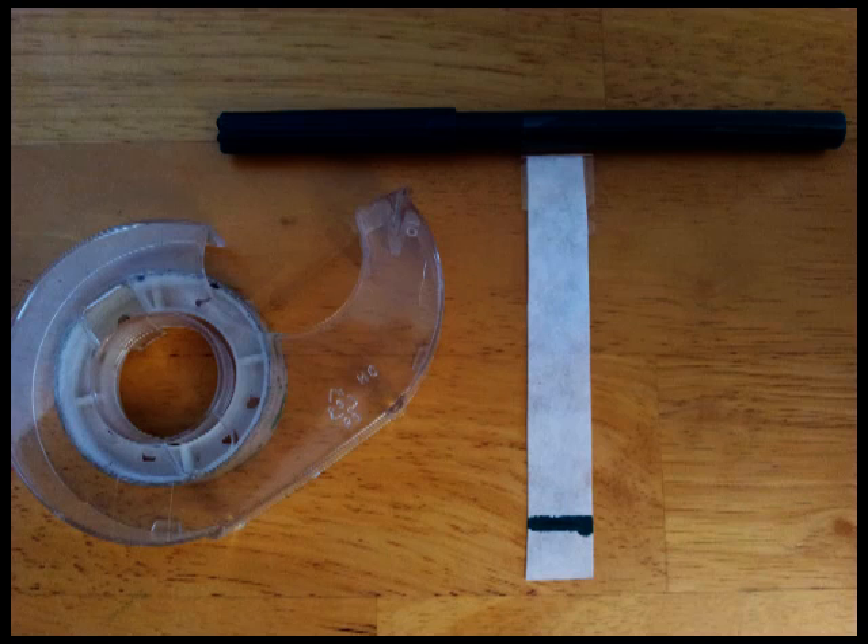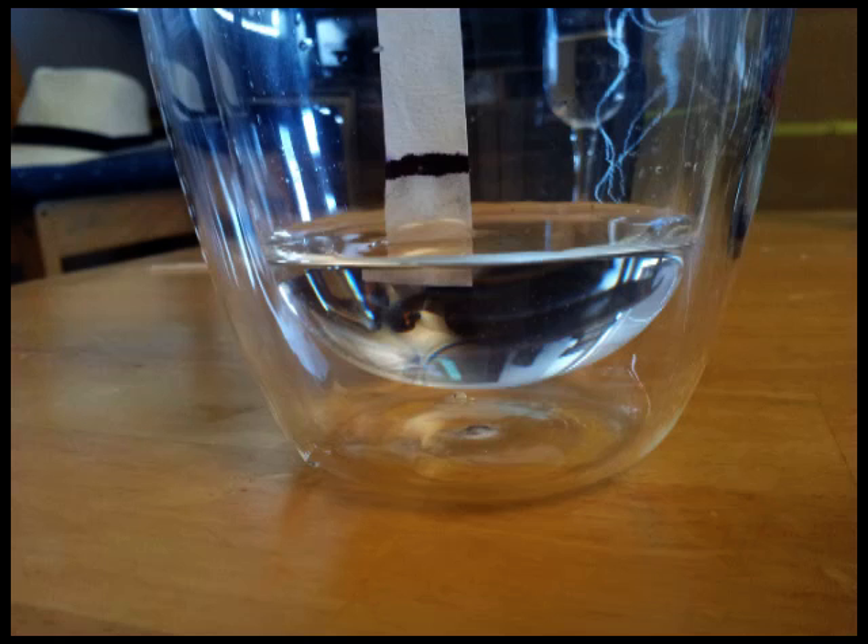The next thing they need to do is tape their strip to the pen itself so that it can be suspended, so that they can hang it down into a plastic cup.